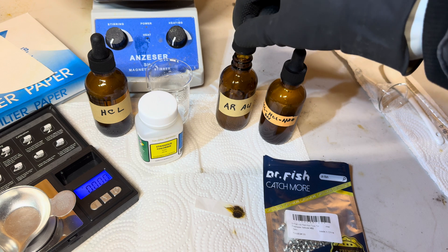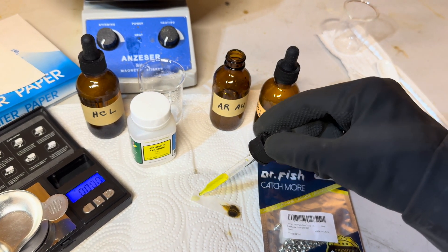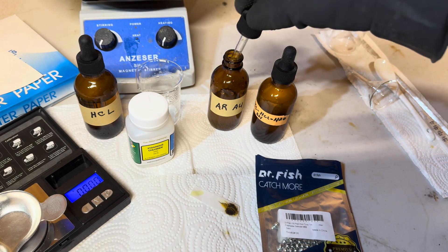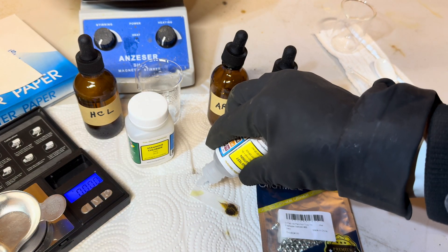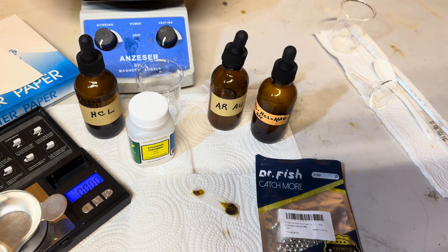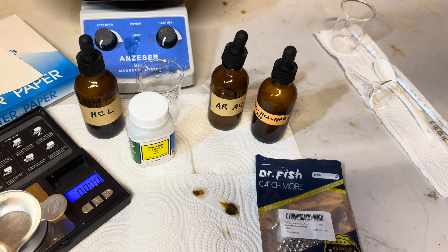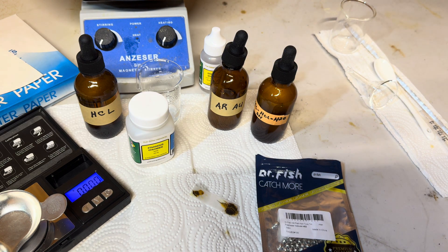What I want to do now is take some of this aqua regia and use the store-bought stannous chloride and see how that compares to the stannous chloride we just made. And you can see the store-bought stannous chloride and our stannous chloride that we just made are working basically the same.